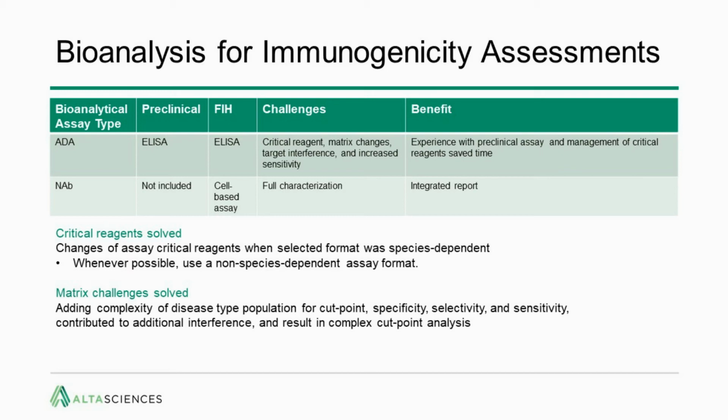Secondly, matrix challenges were solved due to proactive knowledge of the challenges that would be encountered in the clinic, such as adding complexity of disease type populations for cut point, specificity, selectivity, and sensitivity, contributed to additional interference and result in complex cut point analysis. Our advantage certainly was the ability to obtain pre-treatment samples from appropriate subjects.